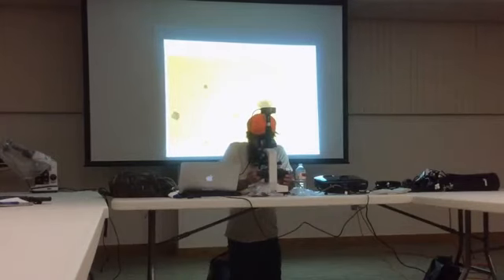We don't know what they're living on. Photons, maybe. So this is the IMO sample, and not nearly as exciting as the soil sample, I don't think it is. But do you notice all these round things that I'm seeing?